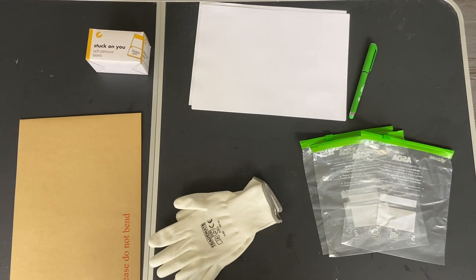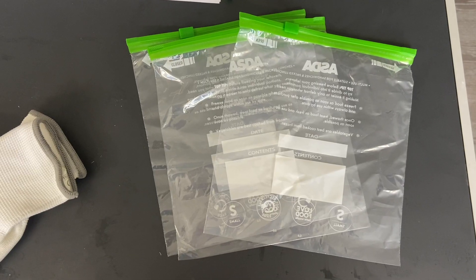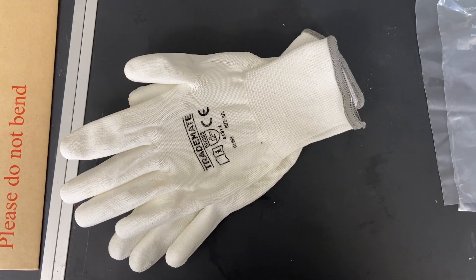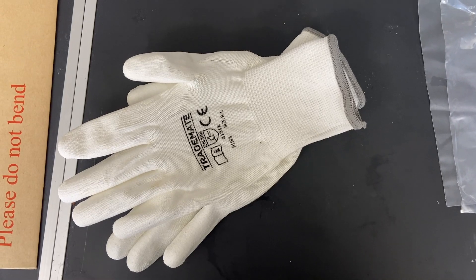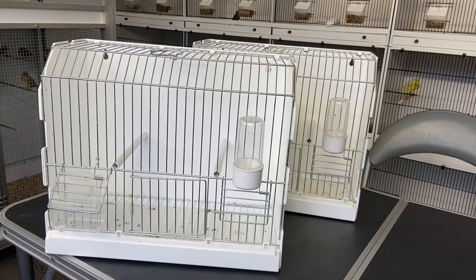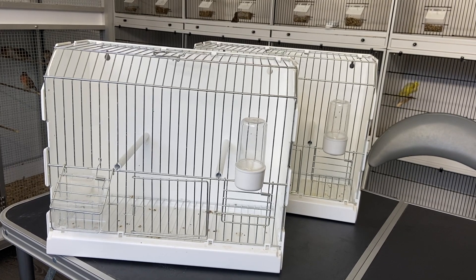This is the equipment that you're going to need: some sterile ziplock bags to put your samples in, some gloves so you don't contaminate your samples, pen and paper to write down the ring numbers, some sticky labels for the samples, and at least two cages to transfer birds to and from.